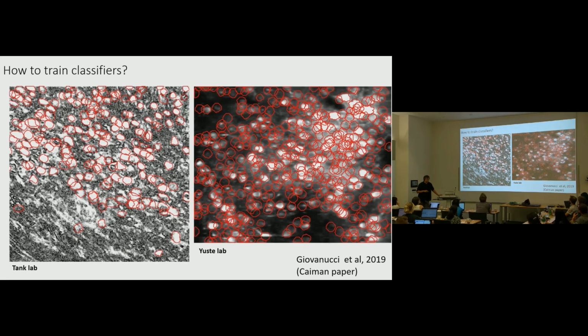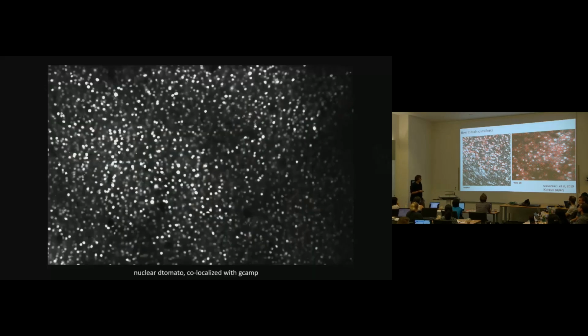And there was the NeuroFinder effort before that, started by Jeremy Freeman here at Janelia, to try to create some kind of ground truth data sets for these kinds of problems. The idea is always, the more ground truth data you have, the more you can lead progress, because coders are good at optimizing things. So if they have some well-defined goal of a benchmark measure, they will probably be able to improve their pipelines. And so that has happened to some extent with these data sets.